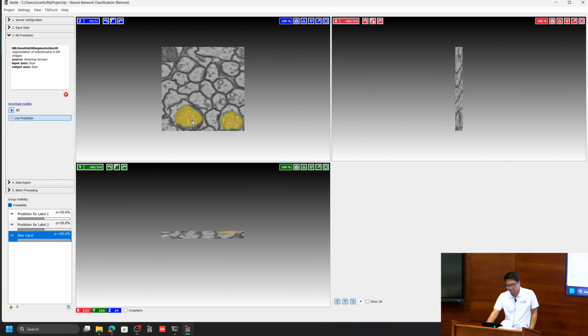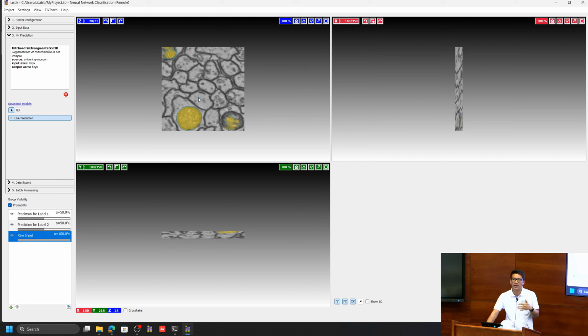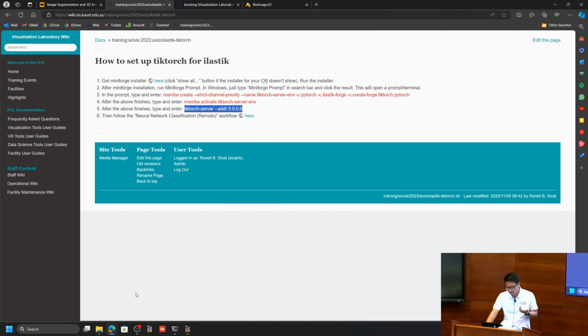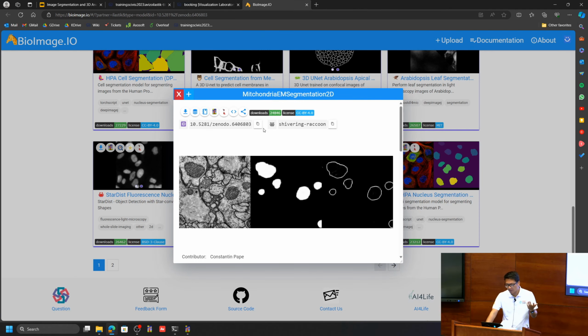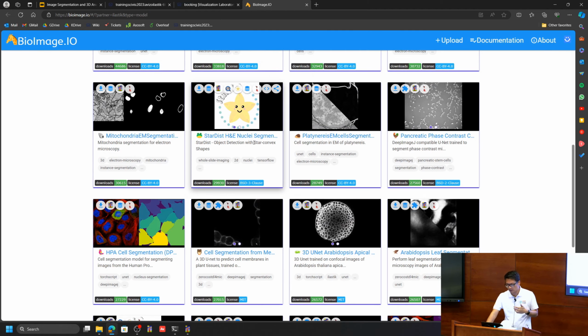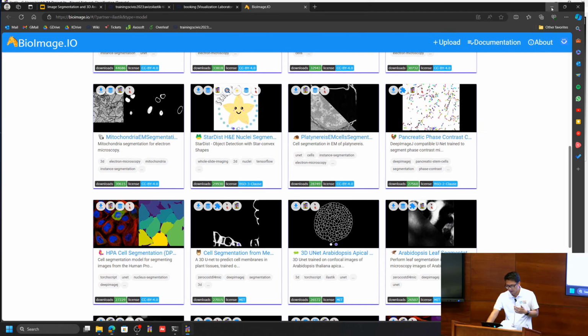But it's basically free, right? You didn't really do anything. And if you're lucky, it will just work perfectly on your data, right? So this is the disadvantage right now. You can't really tweak the model. So if you're not happy with the results, you go back here and pick a different model and then try it out, and so on, okay?